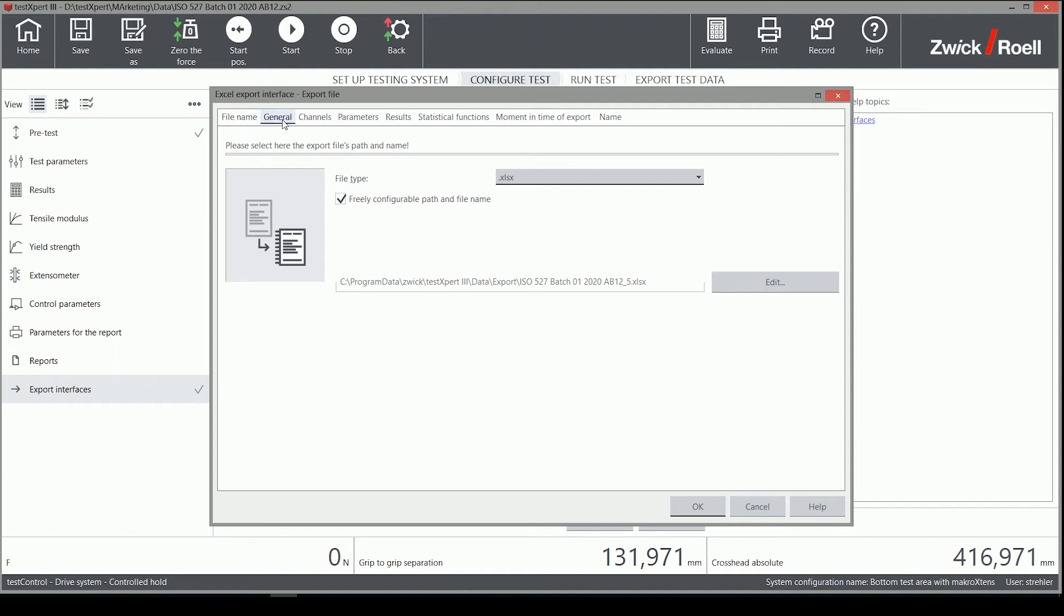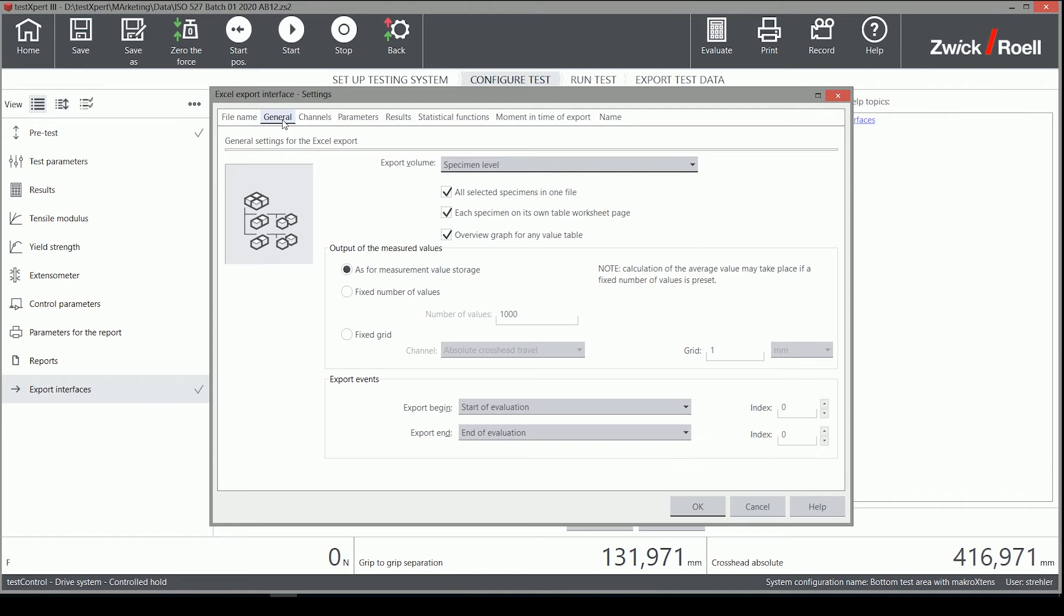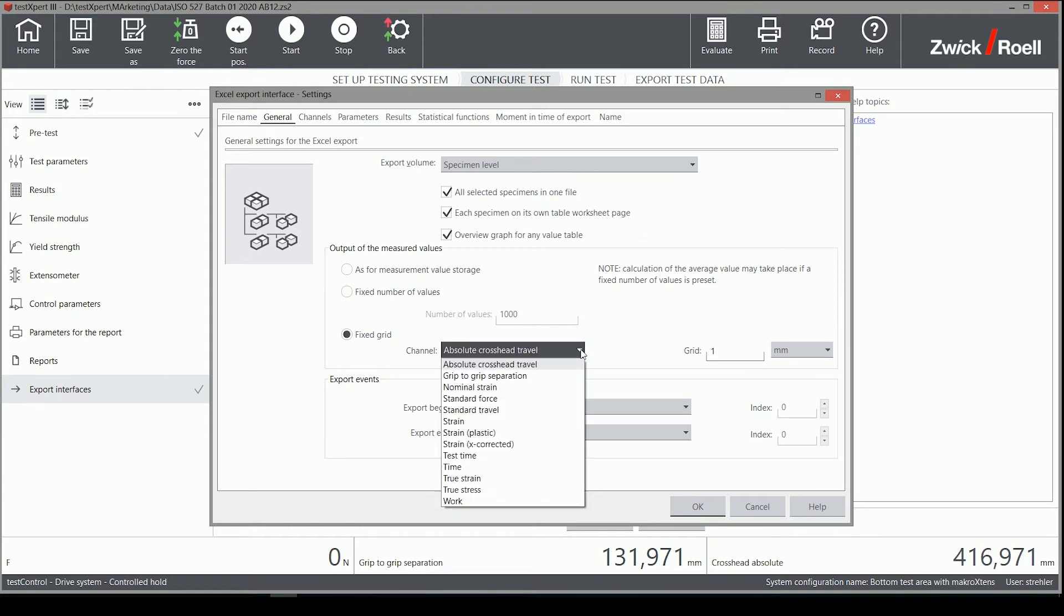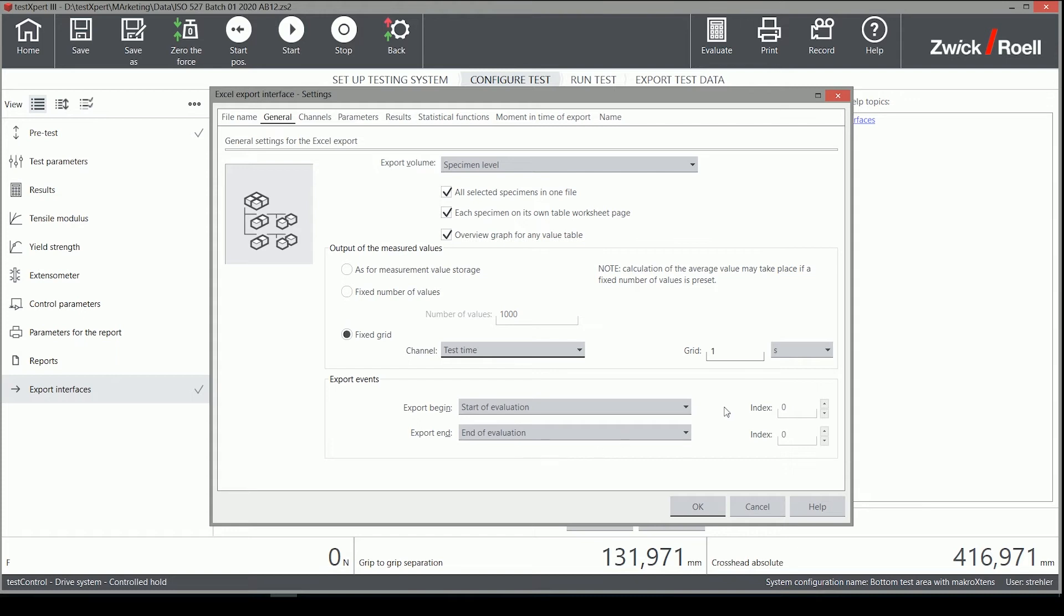On the next tab, some general settings such as what and how many lines of the raw data are exported can be configured. Here, I select to have a fixed grid of exported data every 20 milliseconds.